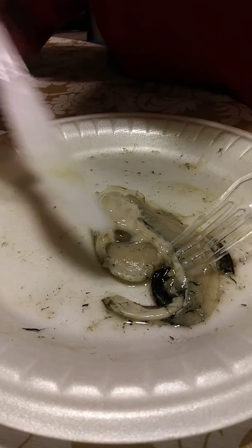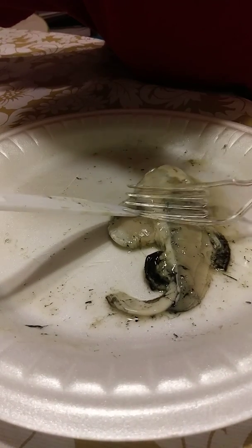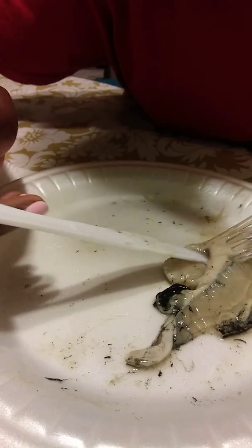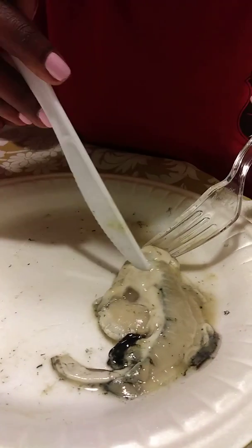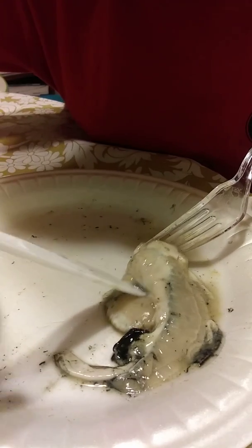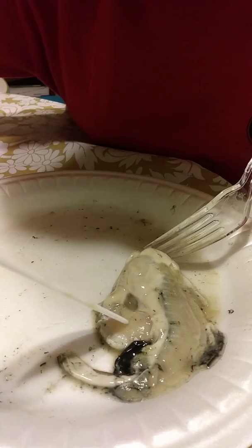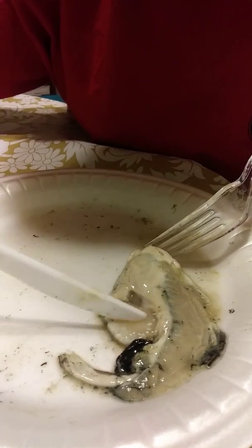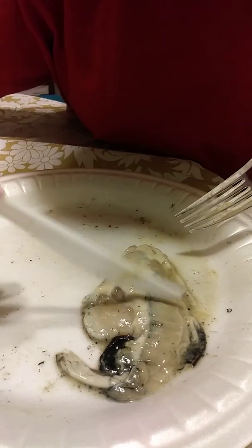This is the heart. And if we cut through here, we can see that it's not beating because this oyster is not living. So that's his heart. This is his heart right here. This is how the blood flows through his heart. And it's a little rougher than the rest of him. Everything else is kind of squishy, but the heart is tough.